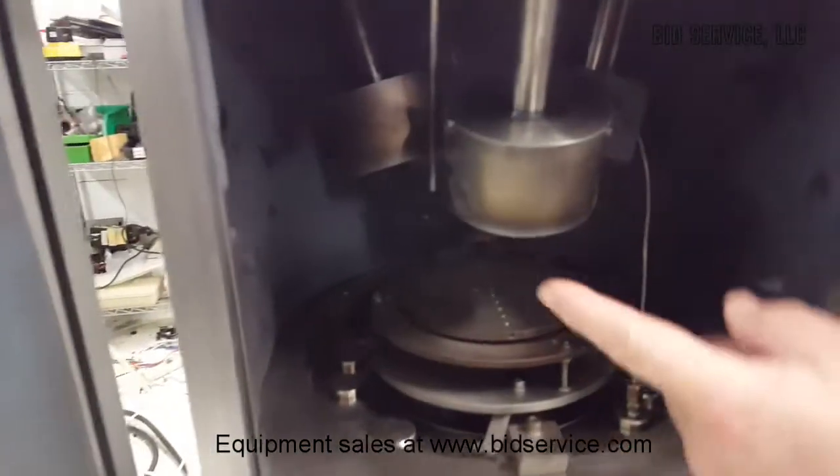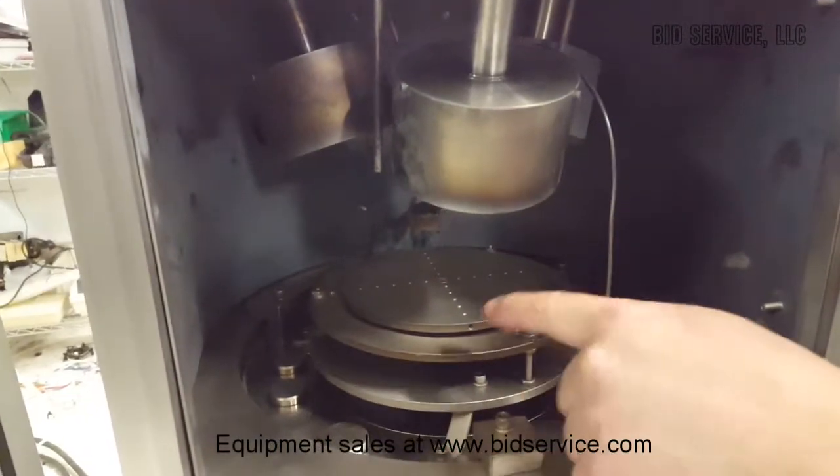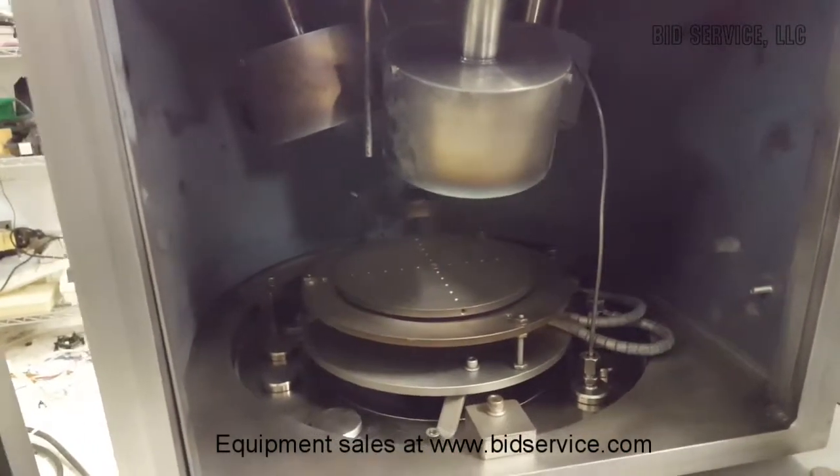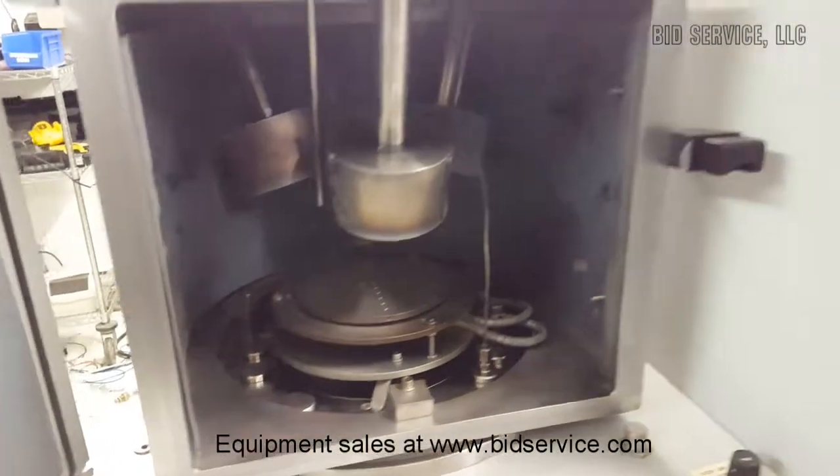I'm going to open it up right here. You can see the inside of the chamber has everything deposited on it. You can see those are your three targets, and it's actually warm in here because we have the substrate heater on.